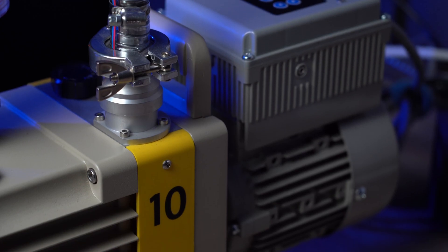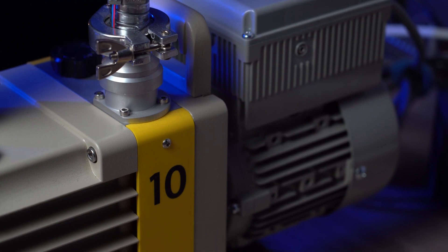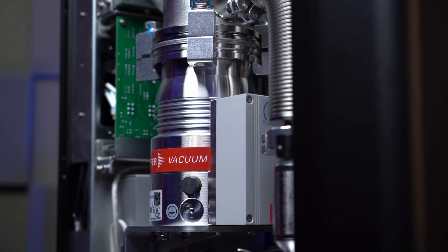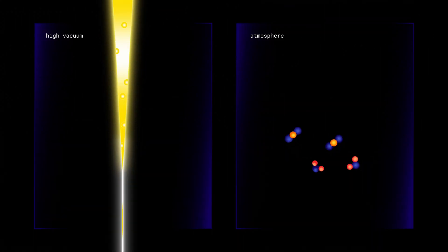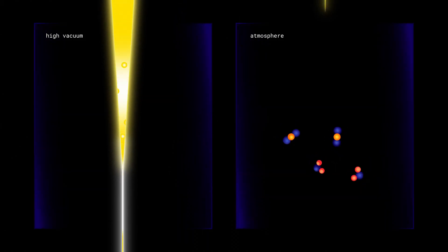And last but not least – vacuum system. We have two pumps – one is the rotary pump outside and the second is a turbo-molecular pump near the column. High vacuum mode is the normal mode of operation for the SEM. A high vacuum minimizes scattering of the electron beam before it reaches the specimen.